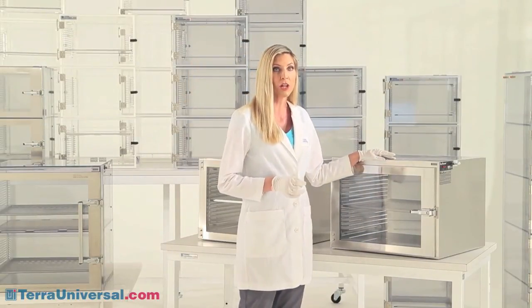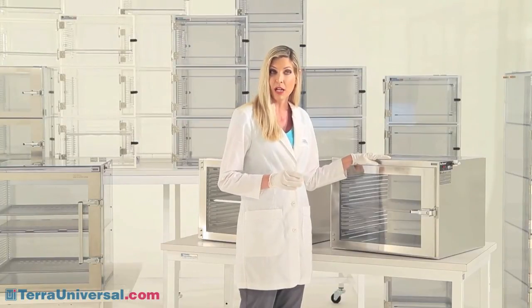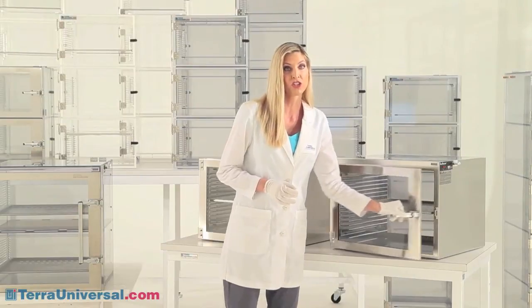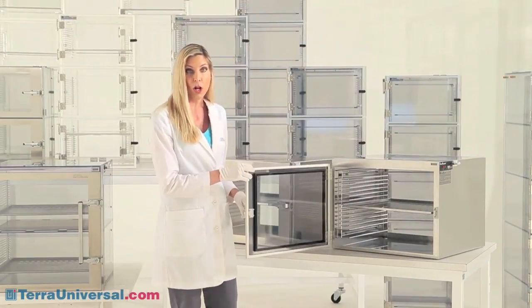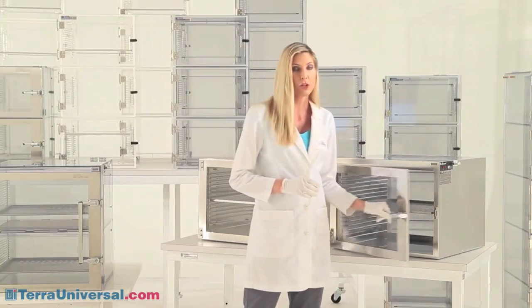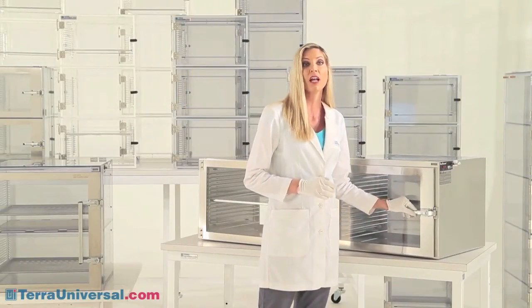Electro-polishing removes the top layer of surface impurities, including iron, leaving a chromium-rich surface. Electro-polished shelves can be adjusted on electro-polished wire racks. Shelves are sealed in plastic before shipping to ensure that they arrive clean and ready to install.